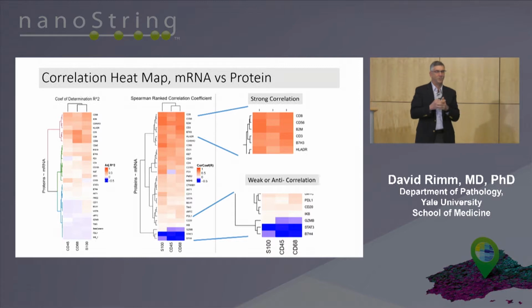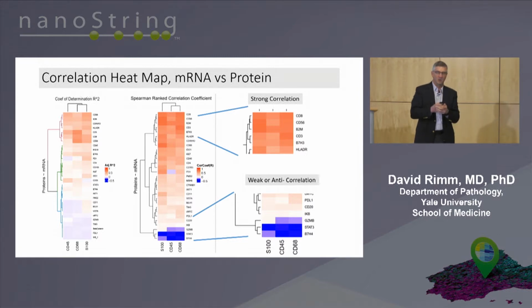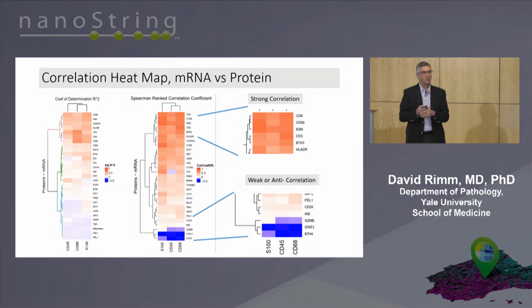So this is kind of hot-off-the-press data. We still have a lot more analysis to do on this. But I think that this at least illustrates something that we've seen before, and that is that RNA doesn't equal protein, but protein does equal function. Protein and the post-translational modifications that occur to protein really are how functions occur. It's one of the reasons I'm enthusiastic about new protein monitoring tools and the ability to high-plex protein: we can perhaps more closely probe protein with these tools than we were able to by just looking at bulk RNA or even single-cell sequencing.